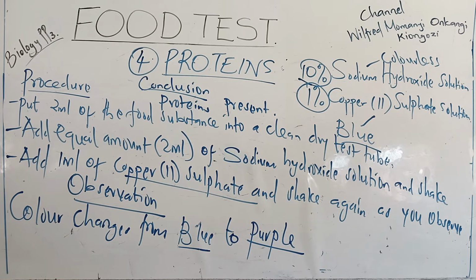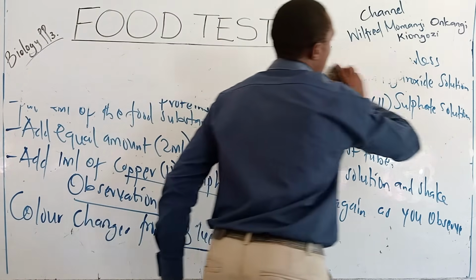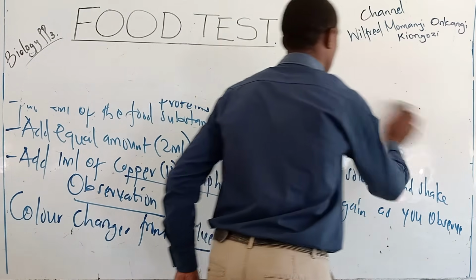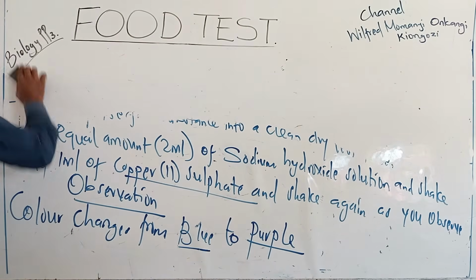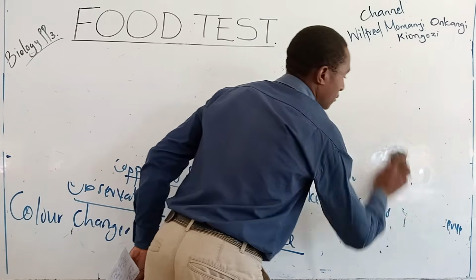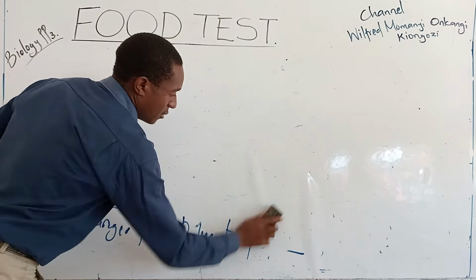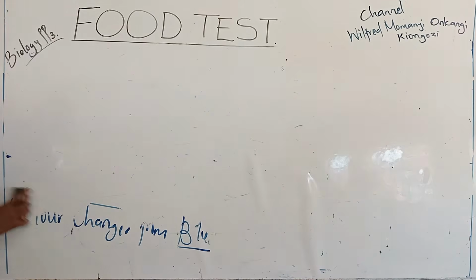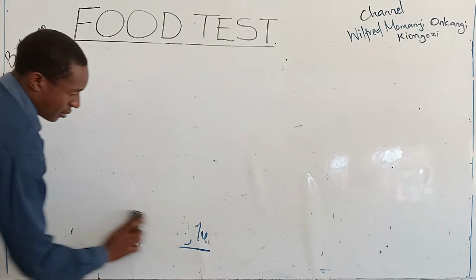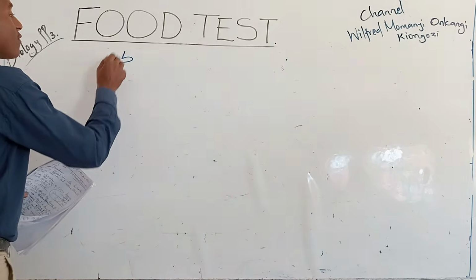We go to vitamin C, our second last. Vitamin C is ascorbic acid, number 5.